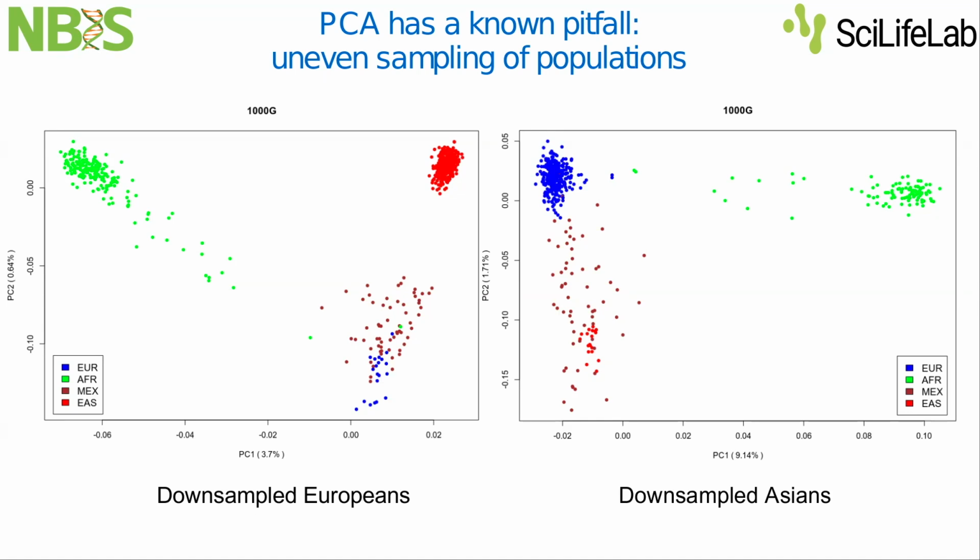And so please be careful if you are looking at PCA maps. Please make sure that if you're projecting a certain population on an atlas, and this is quite relevant to single cell atlases as well, that the reference populations are sampled evenly, what is called even sampling.